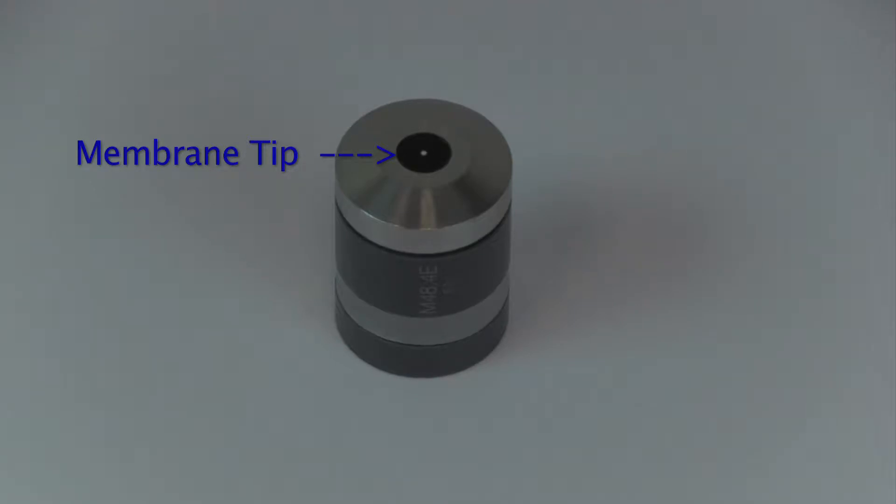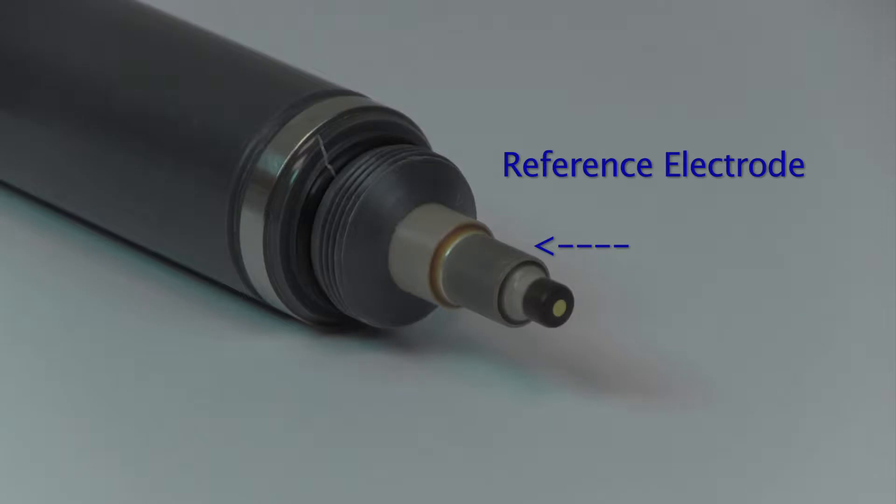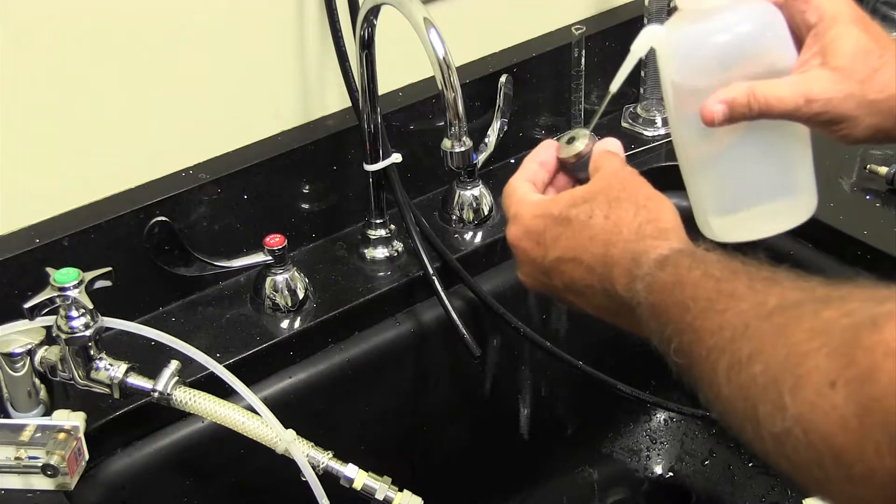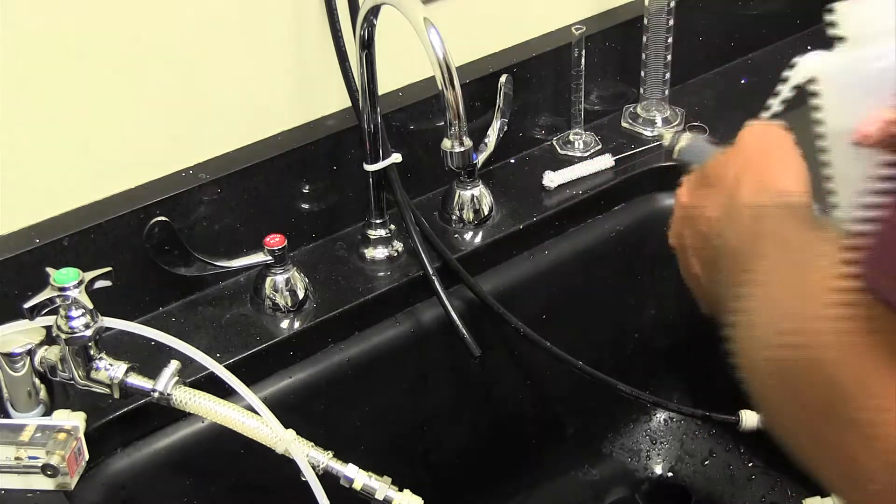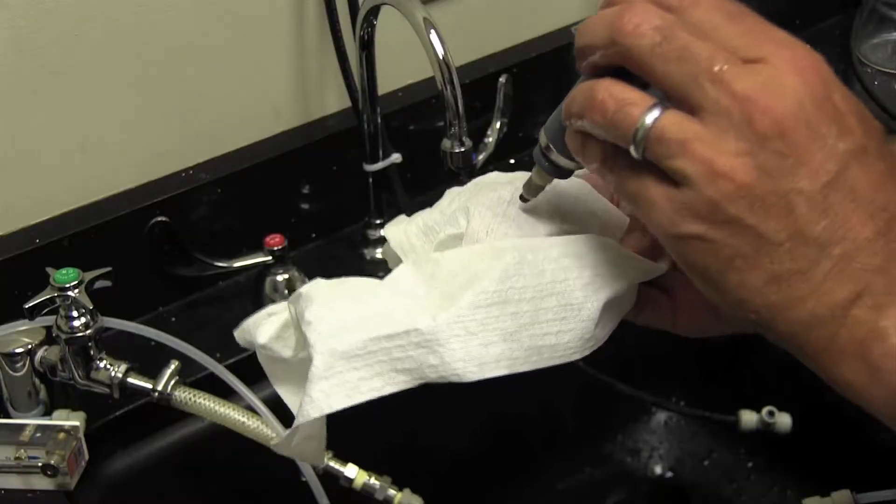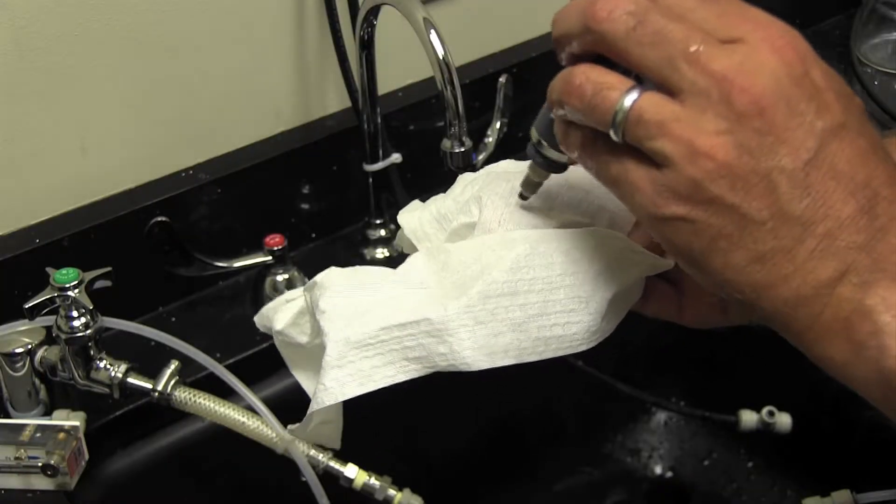Also, do not touch the membrane surface, which is located on the tip of the cap, or the gray colored reference electrode. It is okay to rinse these surfaces to flush away any old electrolyte, and then use a paper towel to dry the gold tip of the working electrode.